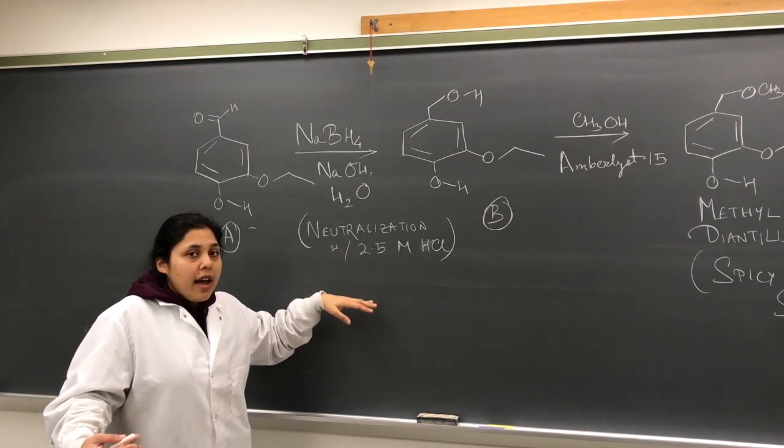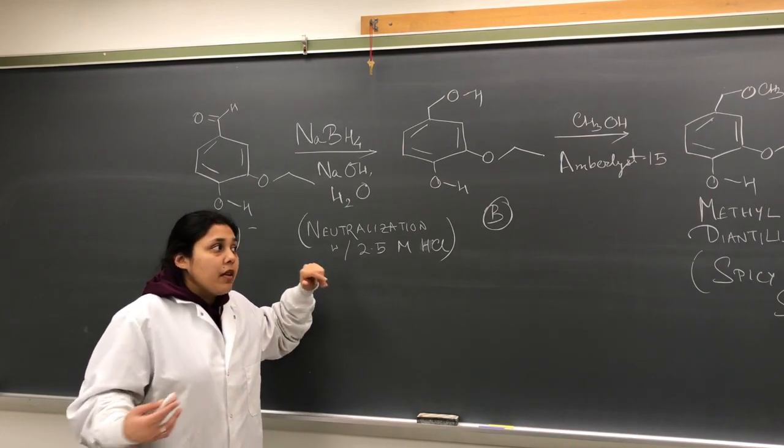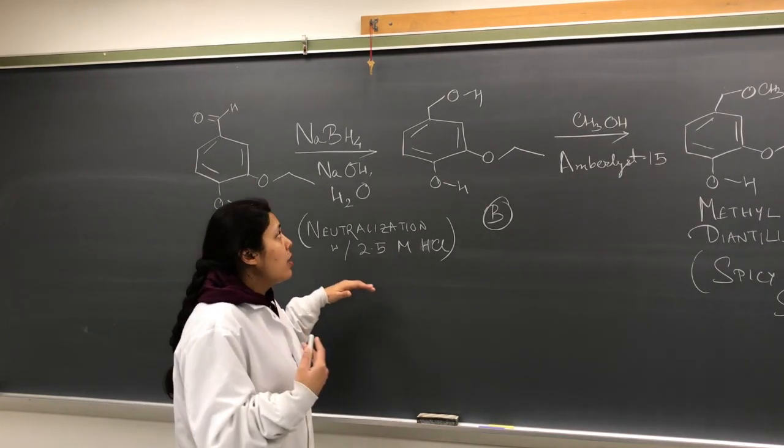So after you're done with the reaction, make sure your pH is a little bit acidic. You have to test it with your pH paper. If not, you're going to lose a bunch of your compound.